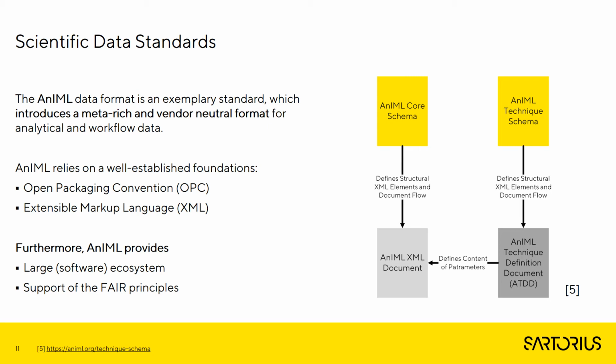AnIML comes with two distinct schemas. The AnIML core schema enforces the structure of AnIML documents, like the experimental steps, used and produced samples, or digital signatures. Further, the AnIML technique schema provides a specification of a used method, including all required parameters.